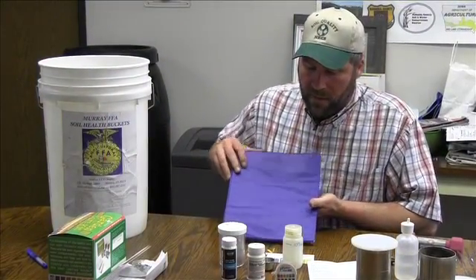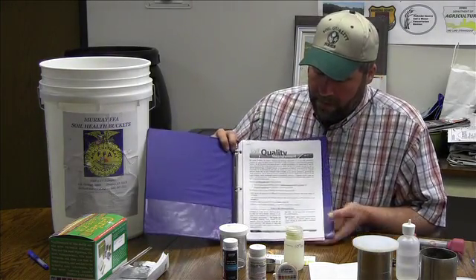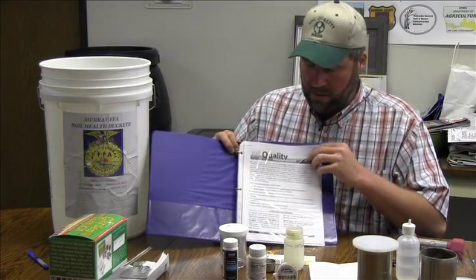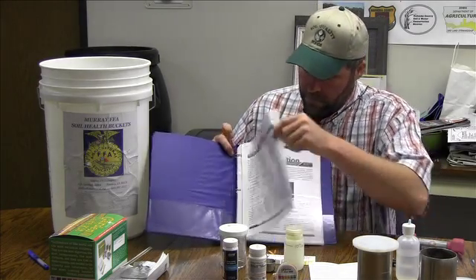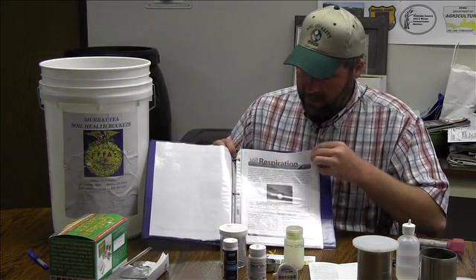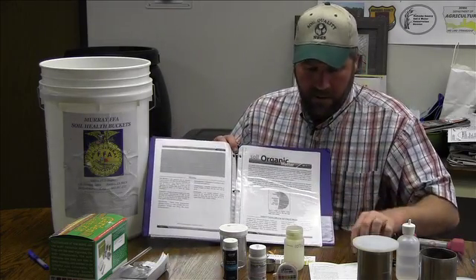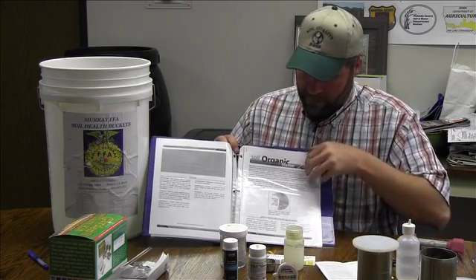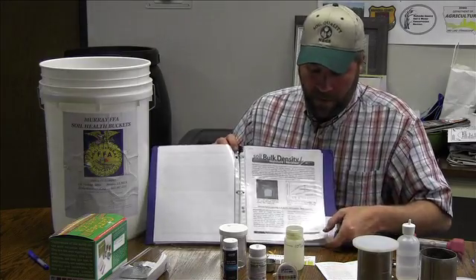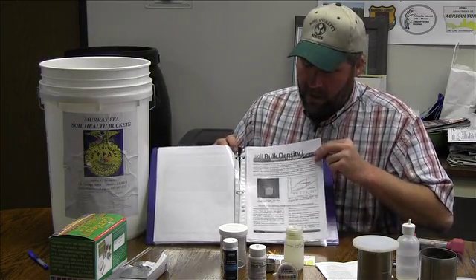The last thing in the soil health bucket is a binder. In that binder, each little packet talks about the different tests that we just briefly showed. Here's the soil respiration — that would be the Solvita kit. Soil organic matter and the soil organic matter chart. Bulk density, where we are using the cylinders to measure the bulk density and bring it back to the office.